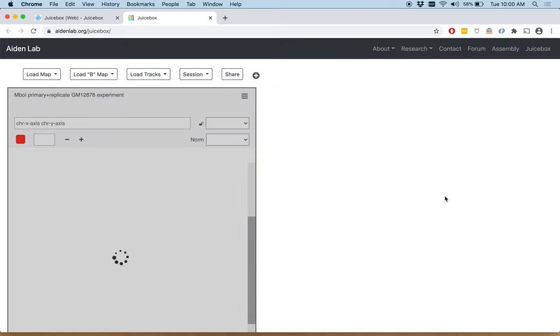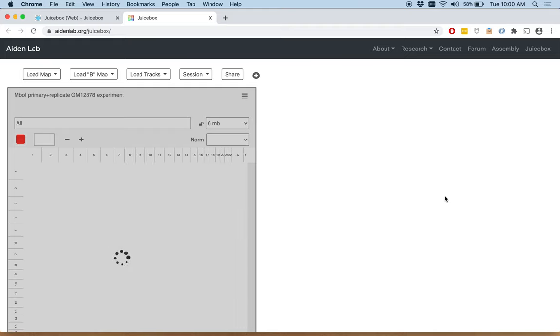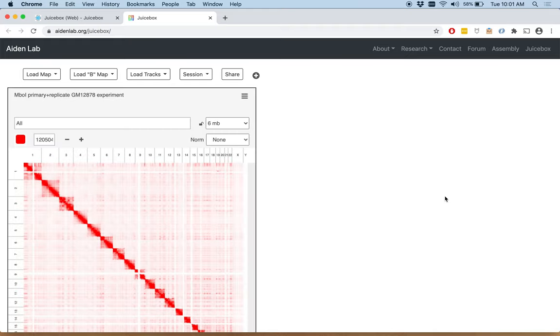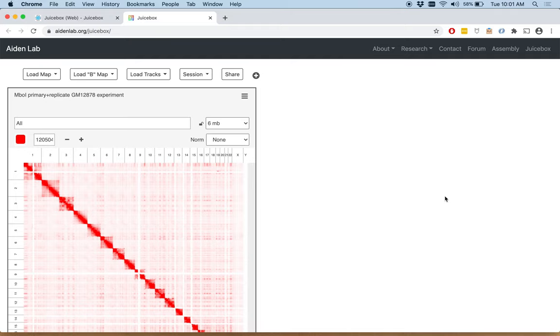While that file is loading, I'll tell you a little bit more about JuiceBox on the web. JuiceBox on the web makes it easy to browse maps side-by-side and to share exactly what you're looking at with collaborators. The core functionality of browsing the maps together with the epigenetic marks is the same as in JuiceBox desktop, but the sharing functionality is easier to use and is also easier to compare maps side-by-side.